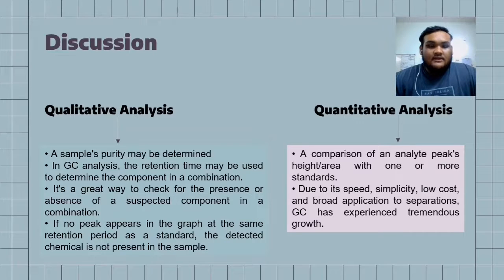present in the sample. For the quantitative analysis, a comparison of an analyte's peak height or area with one or more standards is made. Due to its speed, simplicity, low cost, and broad application to separation, GC has experienced tremendous growth.